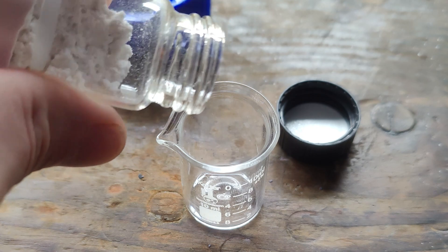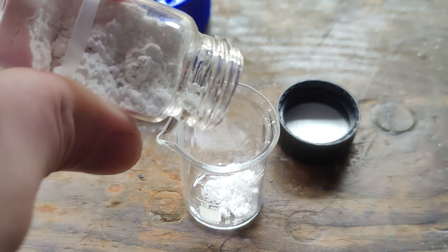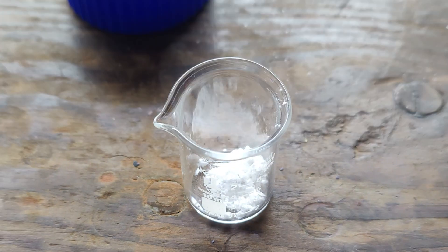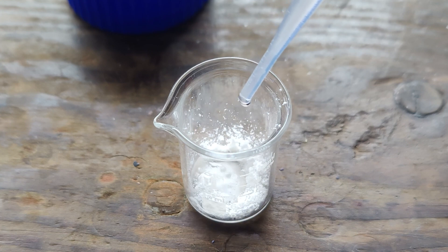One of the unique things about lithium is that it burns a bright pinkish-red color when placed into a flame. So in order to verify that I did in fact extract lithium carbonate, I dissolved a bit in some nitric acid to form a few milliliters of concentrated lithium nitrate. Then I dipped a glass rod in the solution and held it to my torch, and just as I had hoped, I got a nice pink-red flame.